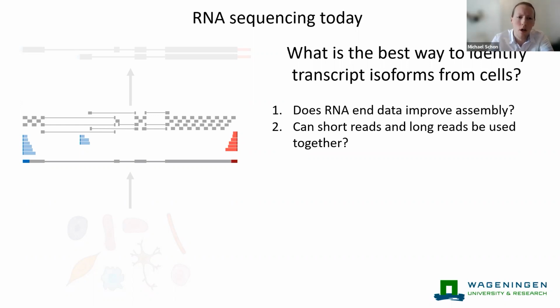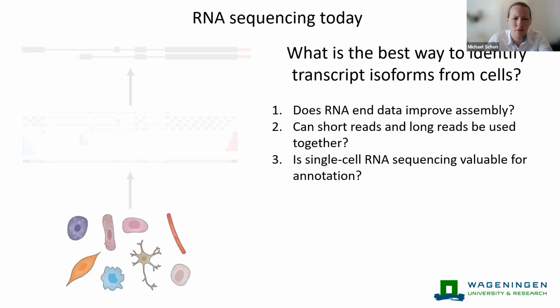Particularly, I wanted to know whether short reads and long reads could be used effectively together in the same assembly model. And finally, what I was really interested in was whether it was possible to build a reasonable assembly of transcript isoforms from single-cell sequencing experiments.